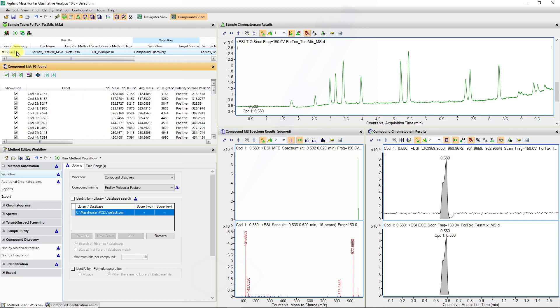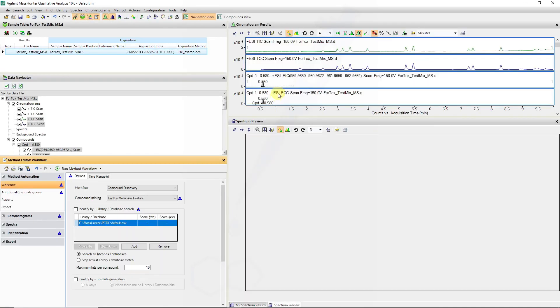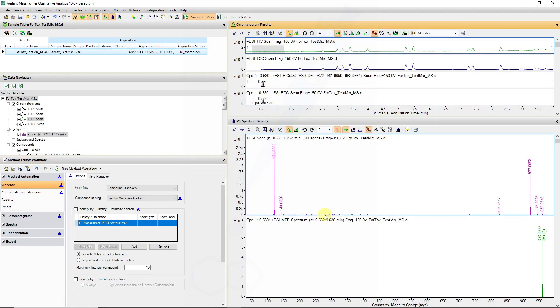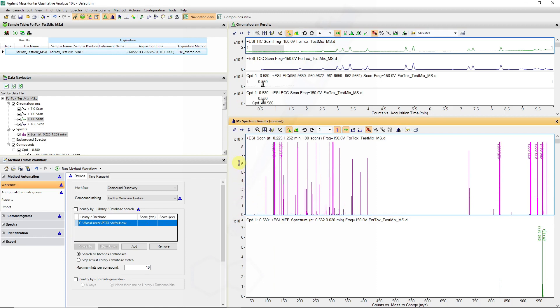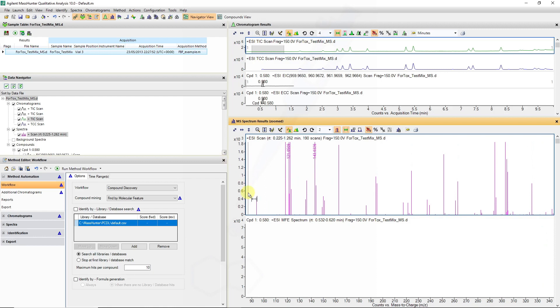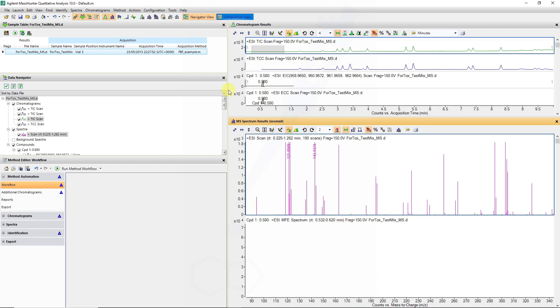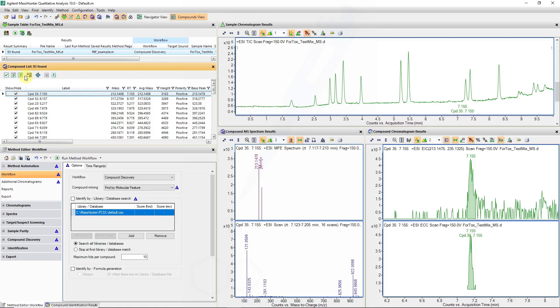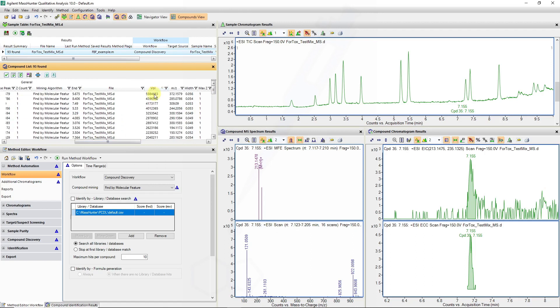Now we can see 94 molecules have been found. It's worthwhile evaluating part of the spectra to see what the typical noise is out of your range. You can do this by going to the navigator view, selecting a region in your chromatogram, and zooming into the low-level noise region to see where we have definitive features versus chemical noise where we don't have isotope patterns. I've established that it's at around 1000 height count. From our 94 features, we can sort these by height or by volume and gauge what are some of the largest features being identified.